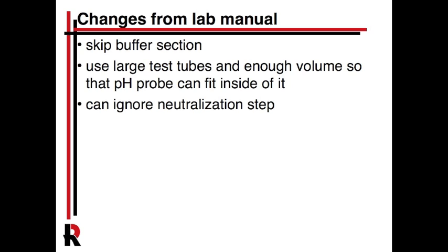The volume really isn't that important. The only time when volume is really important is when you're making solutions, especially when you're doing the dilutions. Also, they have a neutralization step where they talk about having an indicator telling you when it's okay to put down the sink. The concentrations that we're doing and the amount, as long as we use a lot of water, we can just ignore that.